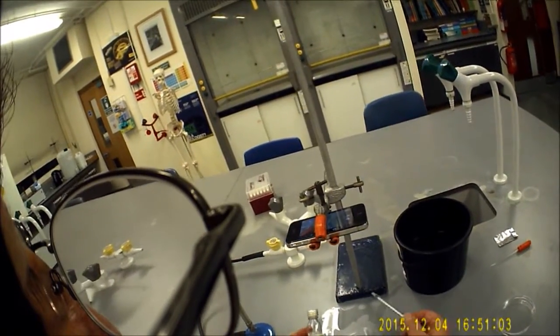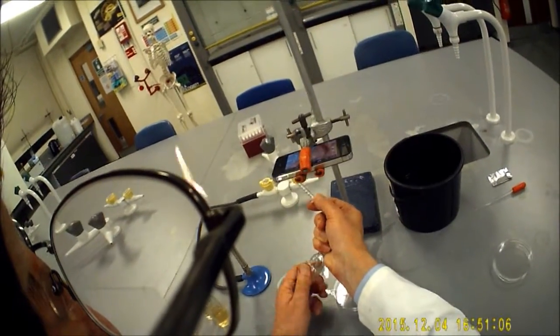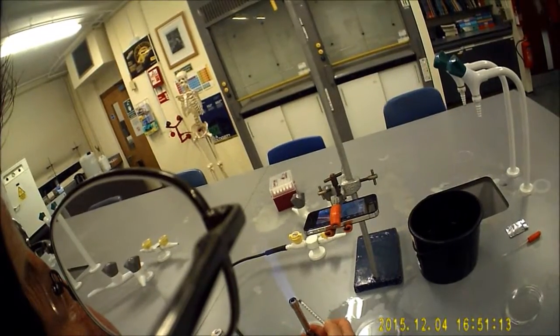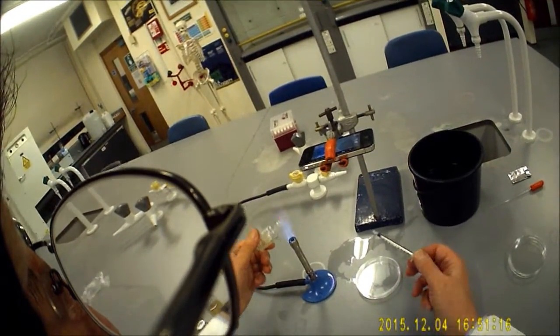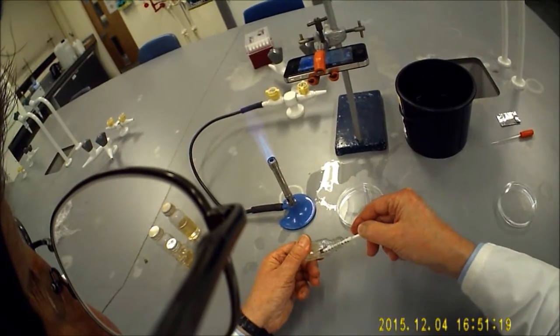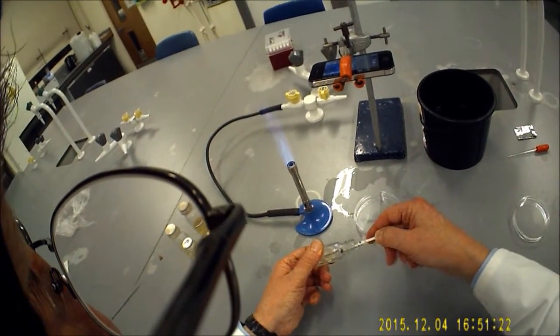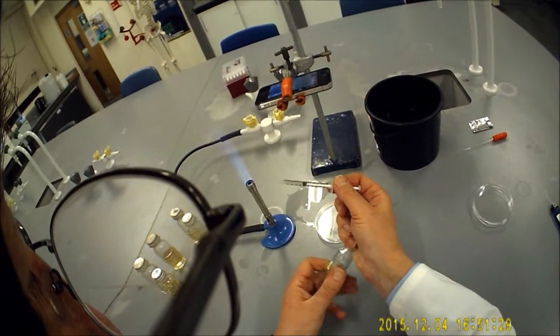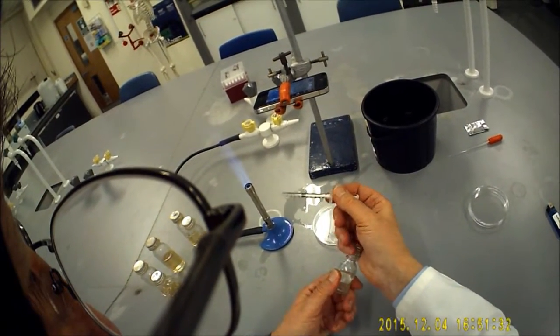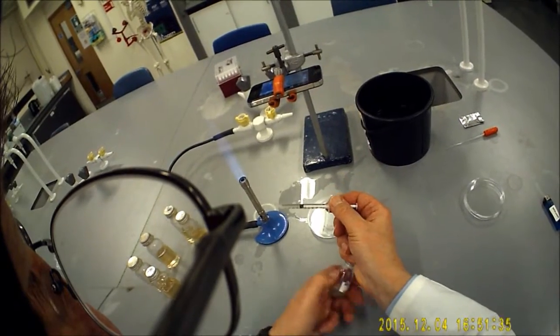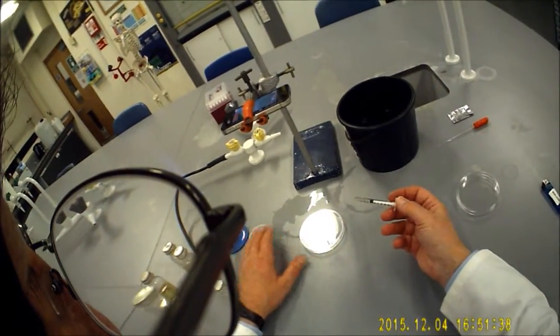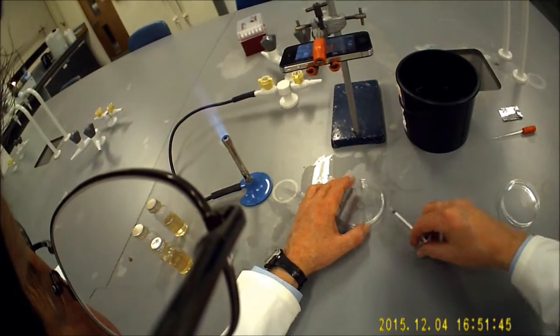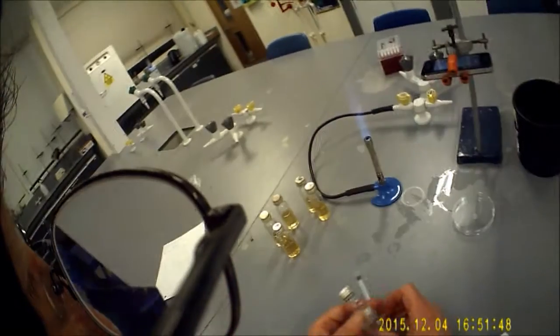I'm going to follow aseptic procedures. I've got my Bunsen burner here. I'm going to flame the mouth of the bottle, draw up 0.5 ml of the culture, flame the bottle again and seal it up. Then just introduce it underneath the lid like that. That's now safe. No contamination can get in there.